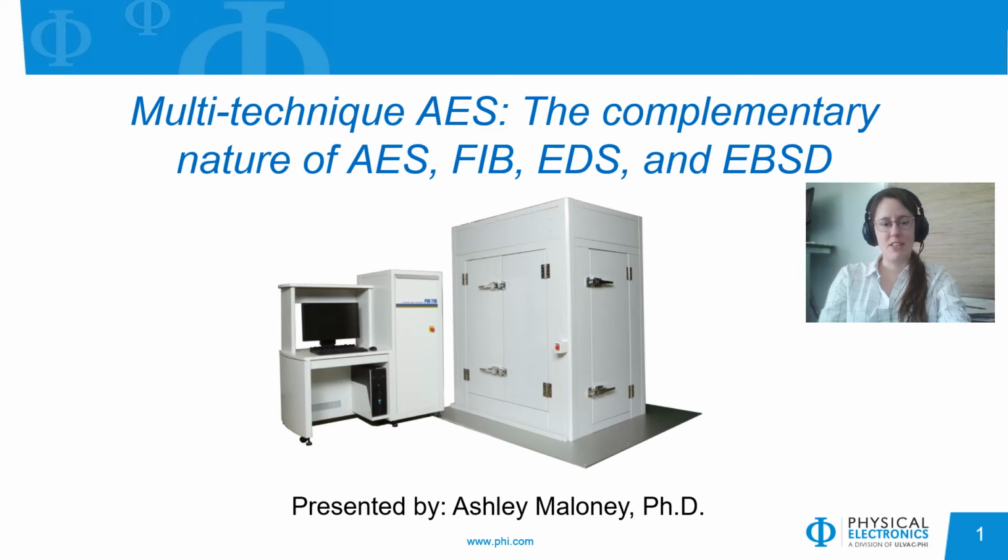Hi, my name is Ashley Maloney, and today I will be talking about multi-technique Auger electron spectroscopy, and specifically I'll talk about the complementary nature of Auger, FIB, EDS, and EBSD, all available in situ on our 710 instrument.